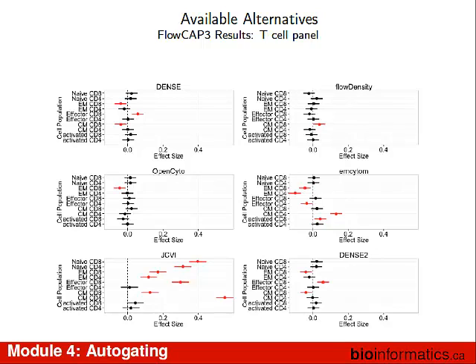But if you look at the proportions in a specific cell population, the proportions coming off one instrument are different from the proportions coming off another instrument. So that's another effect that we can account for. That would be why you have a bar already blocked off. And then on top of that, we account for all those effects.